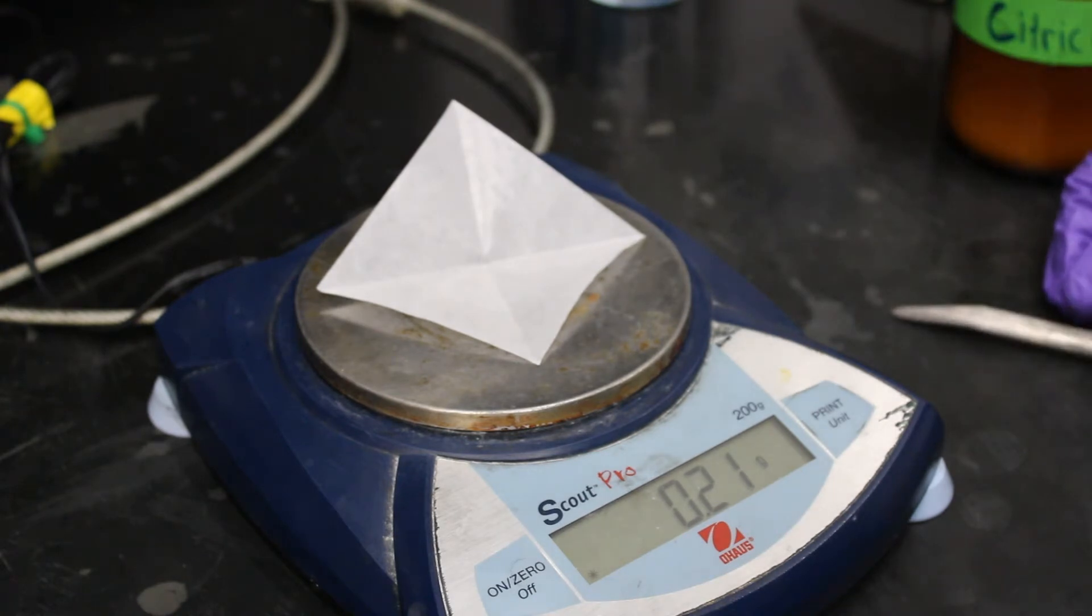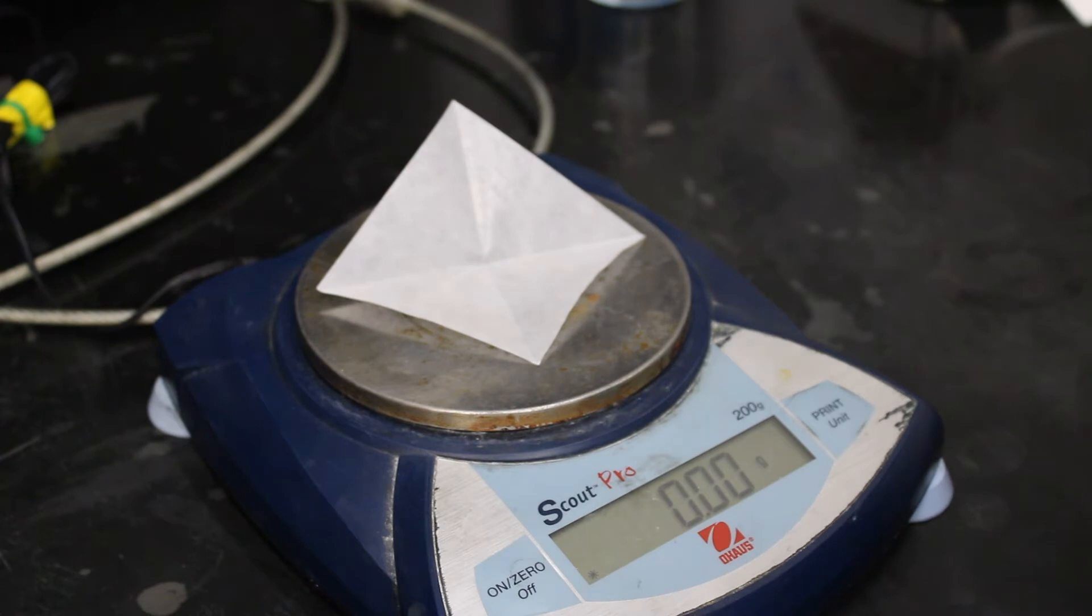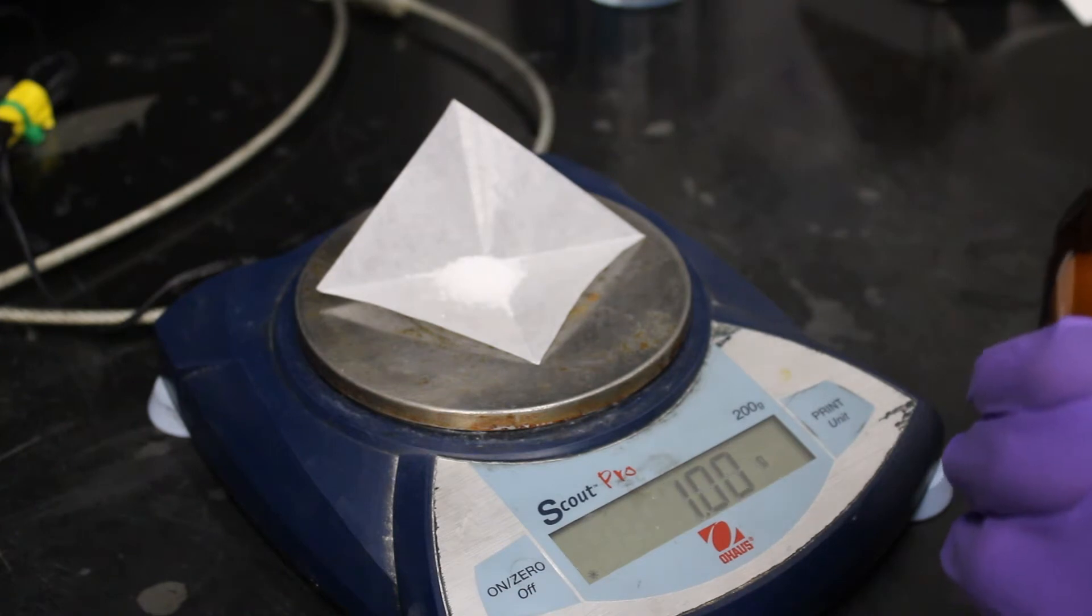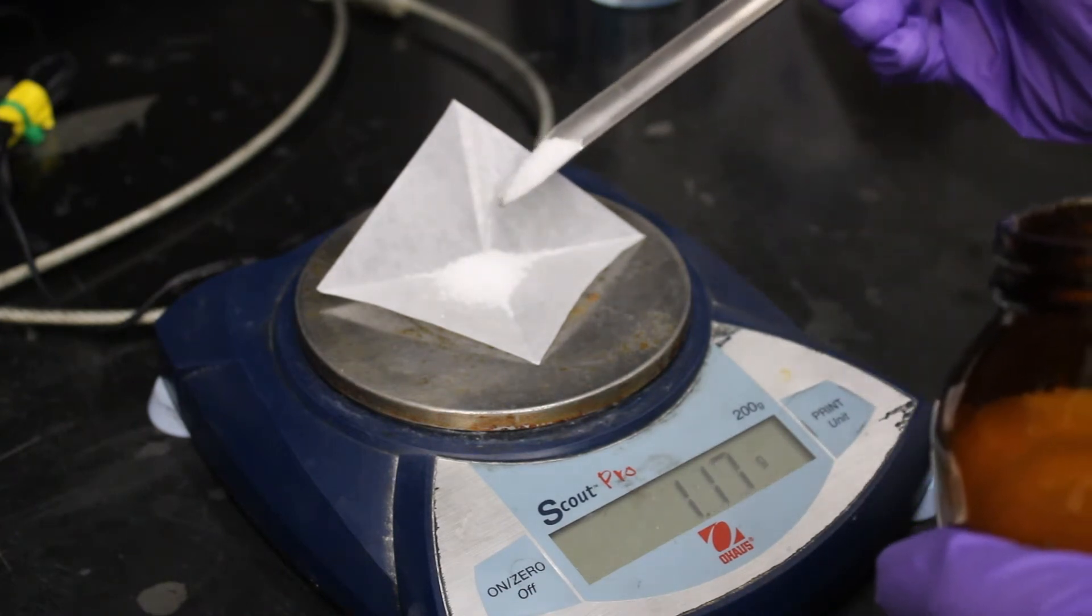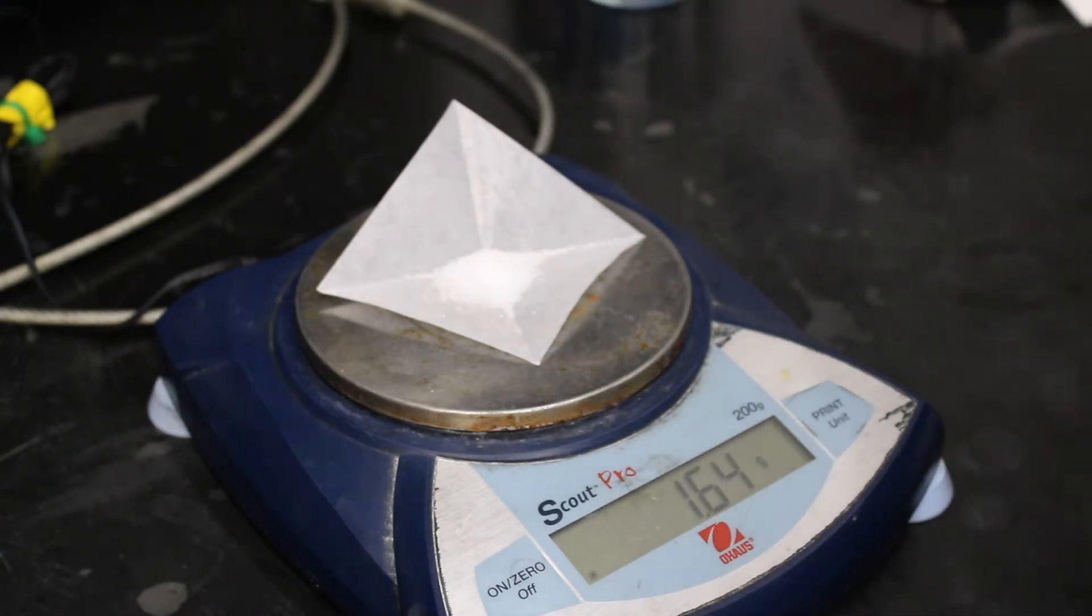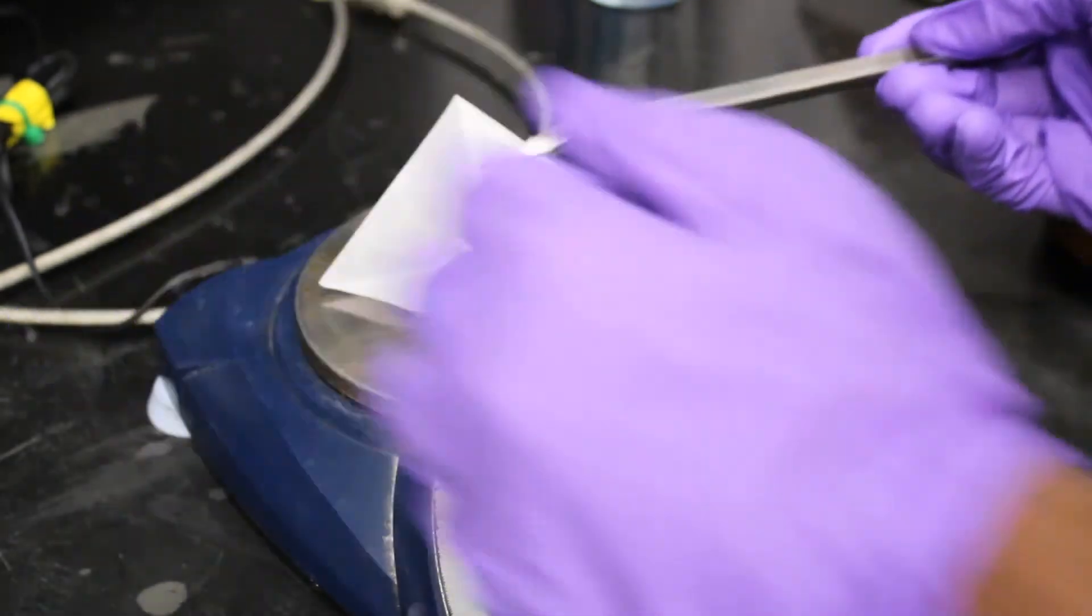When measuring out any solid, place the weighing paper on the weighing scale and zero out the scale. Use the spatula to slowly measure out 1.5 grams of citric acid onto the paper. Slowly tapping on the spatula will allow you to finely control the mass added to the weighing paper.